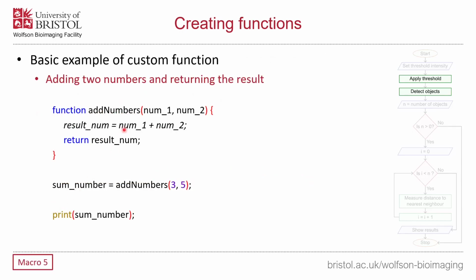So an example of this, a very basic example, might be adding 2 numbers together. And this is a very basic example because obviously this only requires us using one operation, and so why would you go to all this effort to do num1 plus num2? Well, simply you wouldn't. But instead of just having this single line here, you might have 20 lines of code or 50 lines of code doing something much more complex.